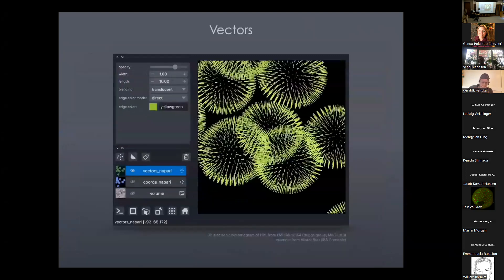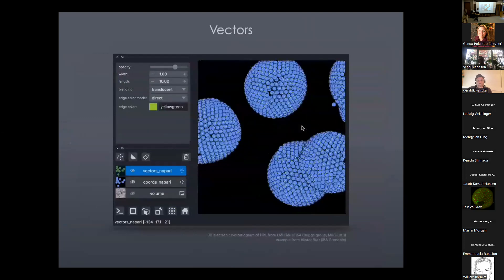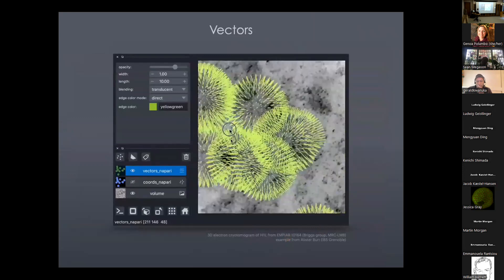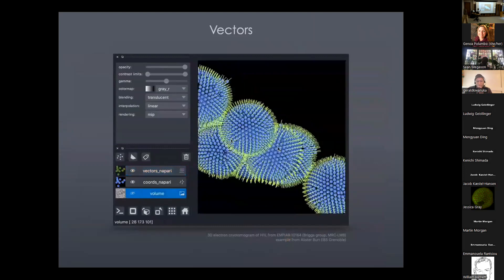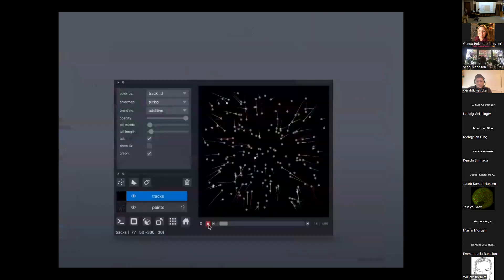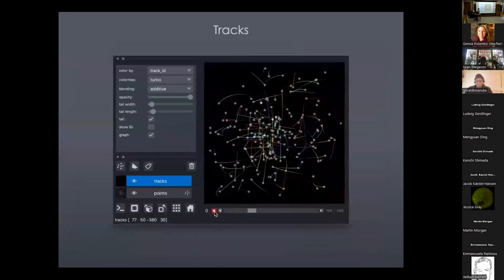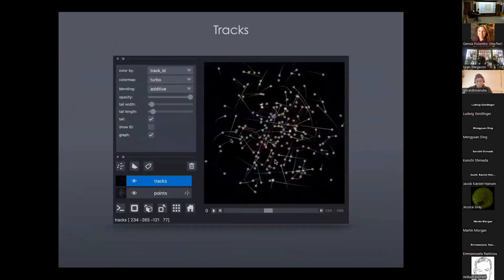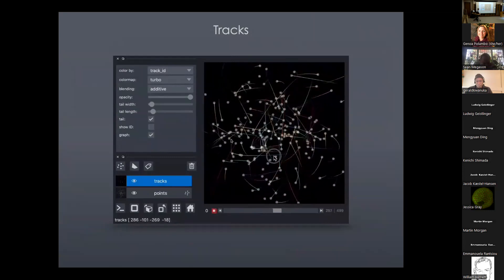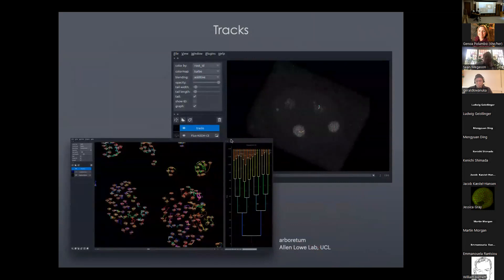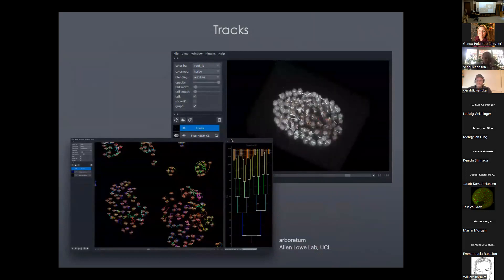Vectors are pretty straightforward — just vectors in n-dimensional space. This is a great dataset from one of the other core developers, Alistair Burt. It's a 3D electron cryotomogram of HIV, demonstrating the orientation of various particles in the capsid using vectors. There is a tracks layer — essentially a points layer that associates points over time, letting you see the temporal provenance of a point as it travels through space. This also supports 3D or ND viewing. It was contributed by Alan Lowe, who has a nice plugin called Arboretum that he uses to show and interactively annotate lineages of cell tracking experiments over time.